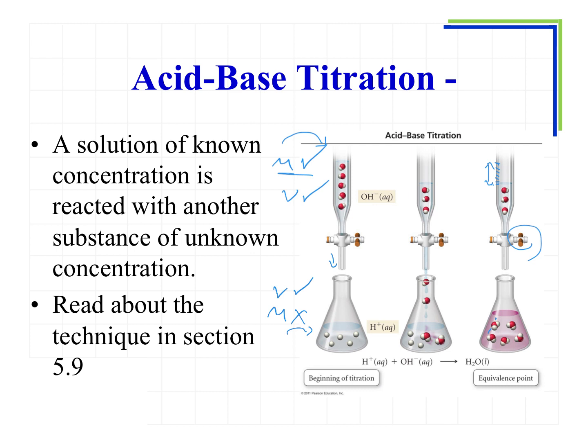You can use the calculation we used in the previous slides, because you know how much of the solution you took, right? You can use a graduated cylinder and take, for example, 20, just like the previous question. We know the volume of the KOH, we didn't know the concentration. So you know the volume, you can solve it for the concentration of the other solution. And as I said, you can read more about the technique in your textbook.